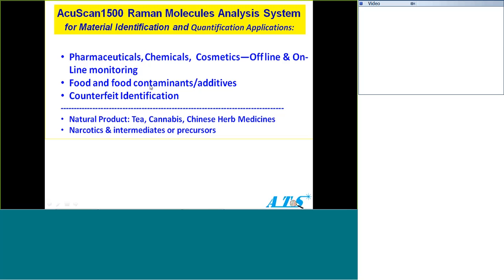One question. Yes. How is the validation method for the instrument? Is an external standard necessary? Is it necessary to calibrate? Is any tool necessary to validate the instrument?